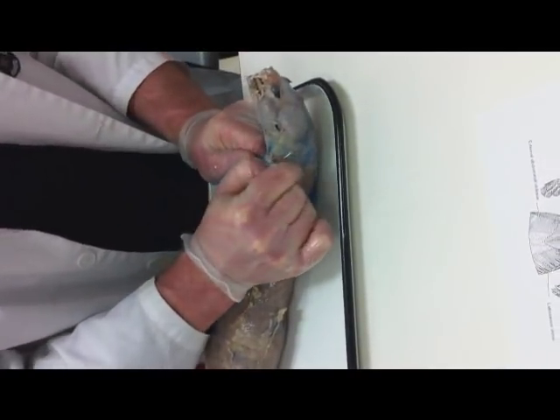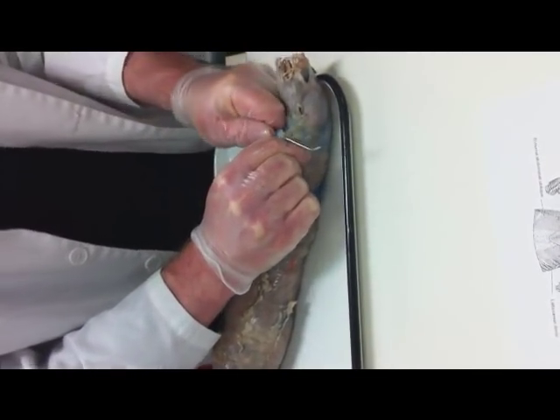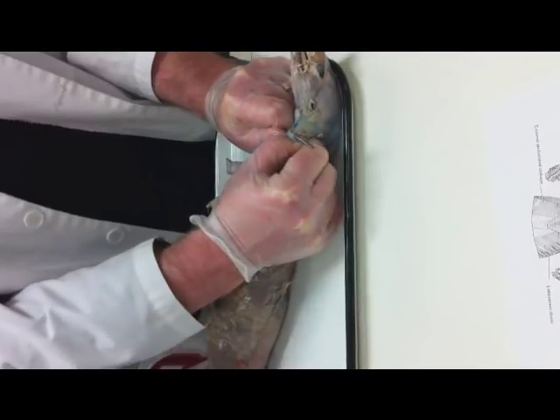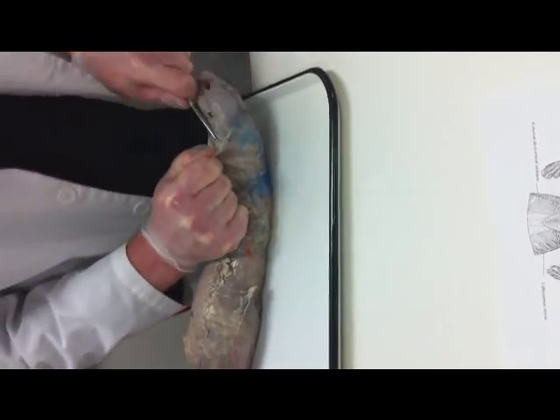Right? So this is all clear, so this has all got to go. So this might be a time when I would actually use a pair of scissors, but I'd be careful so that I'm not going too deep. Right now I choose not to use scissors. I'm just going to probe through it.